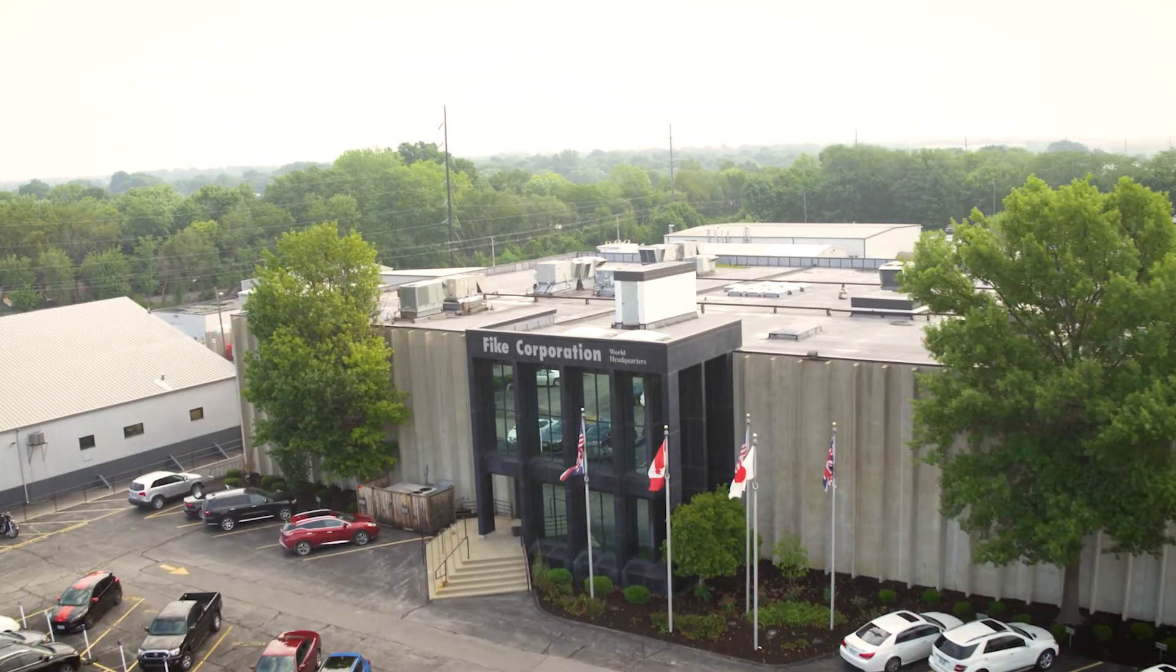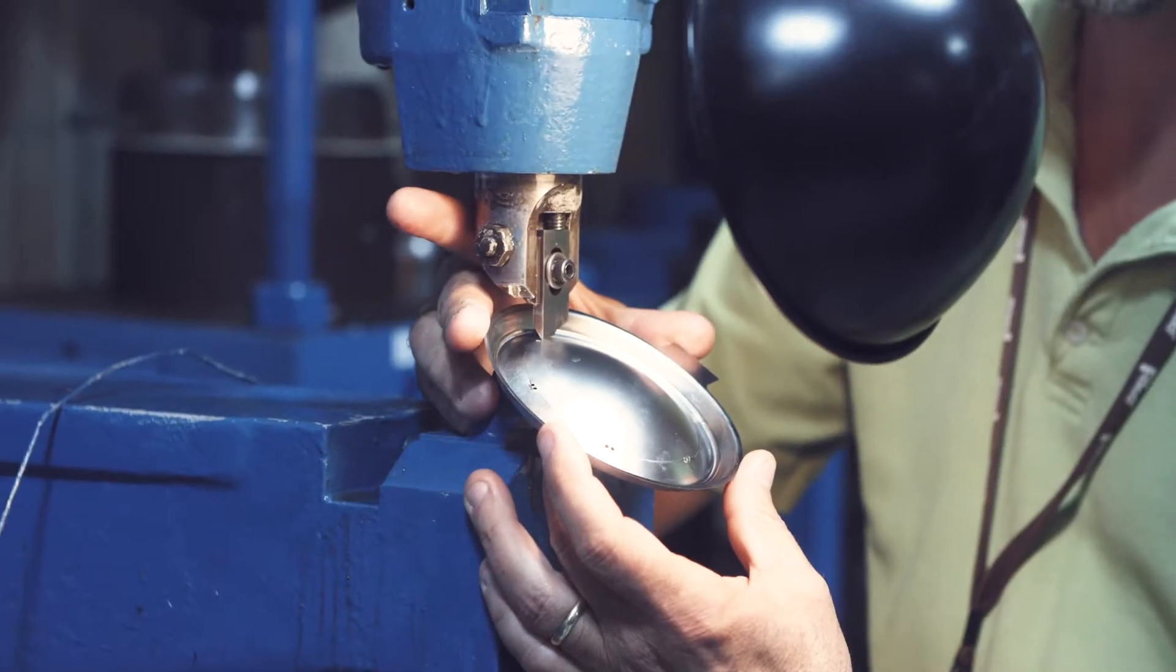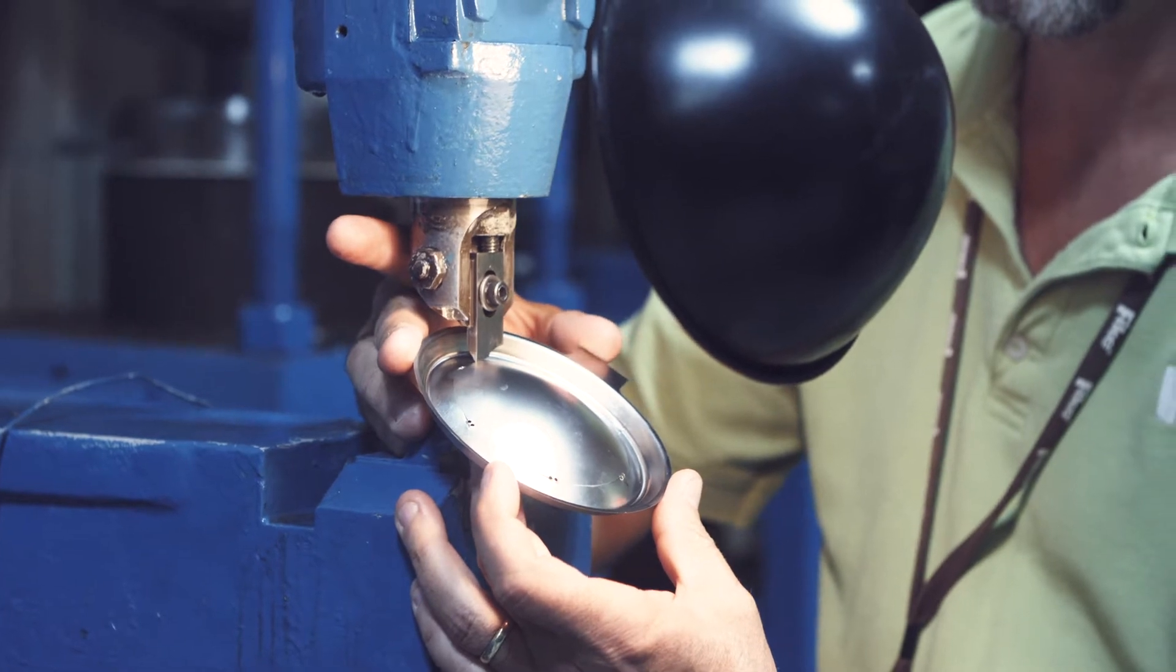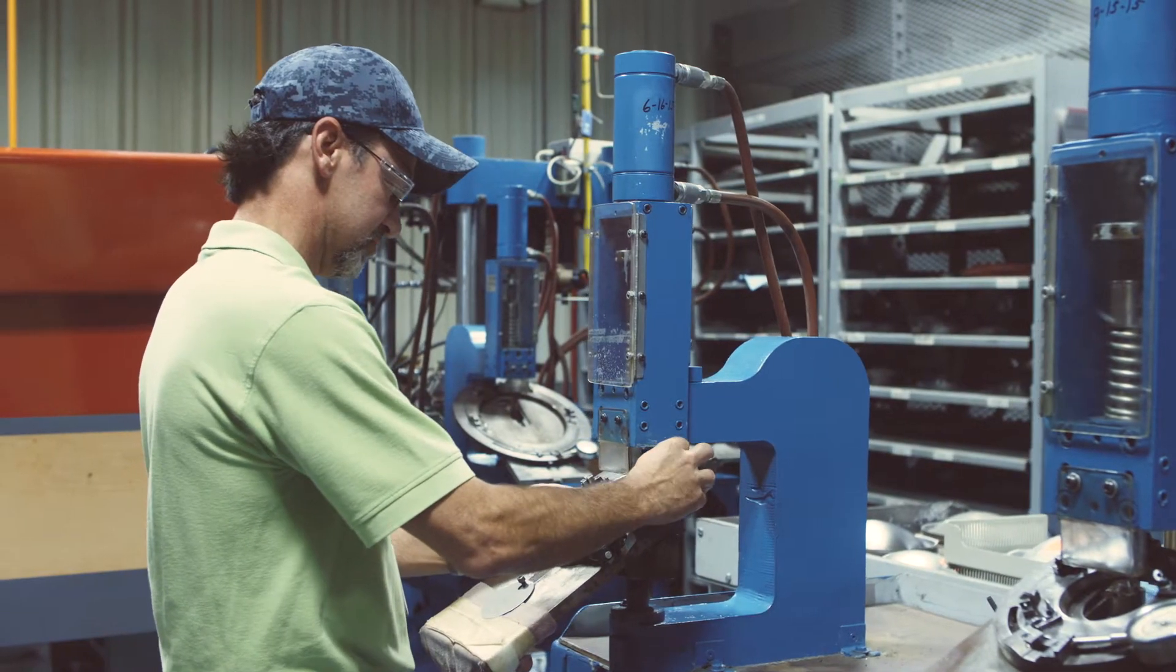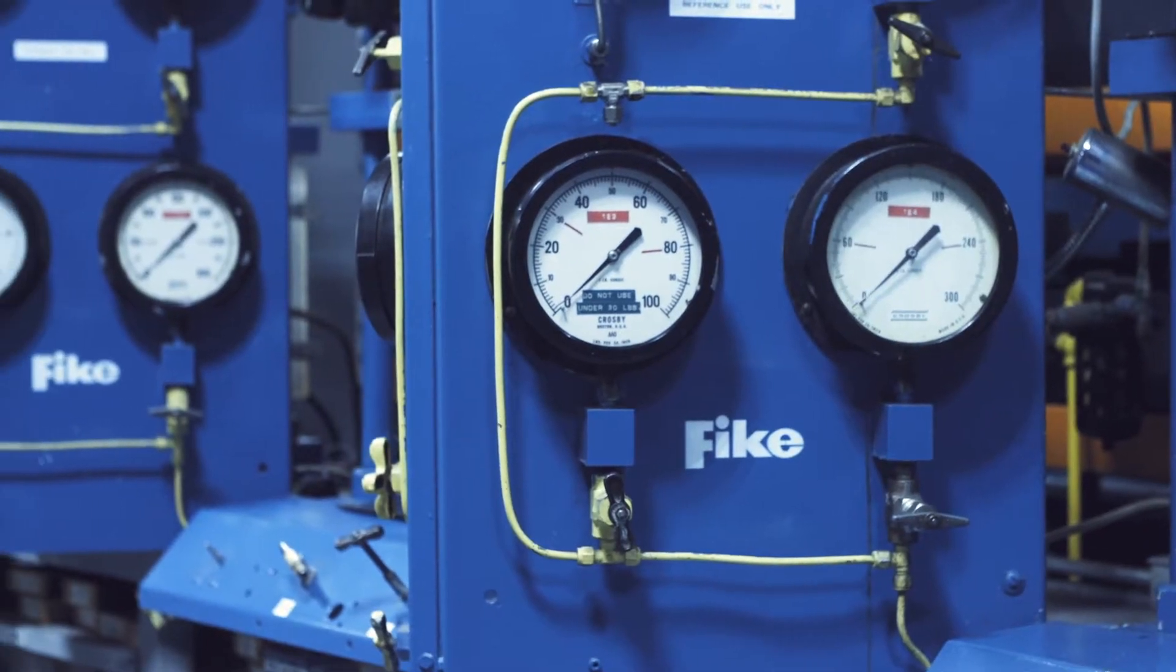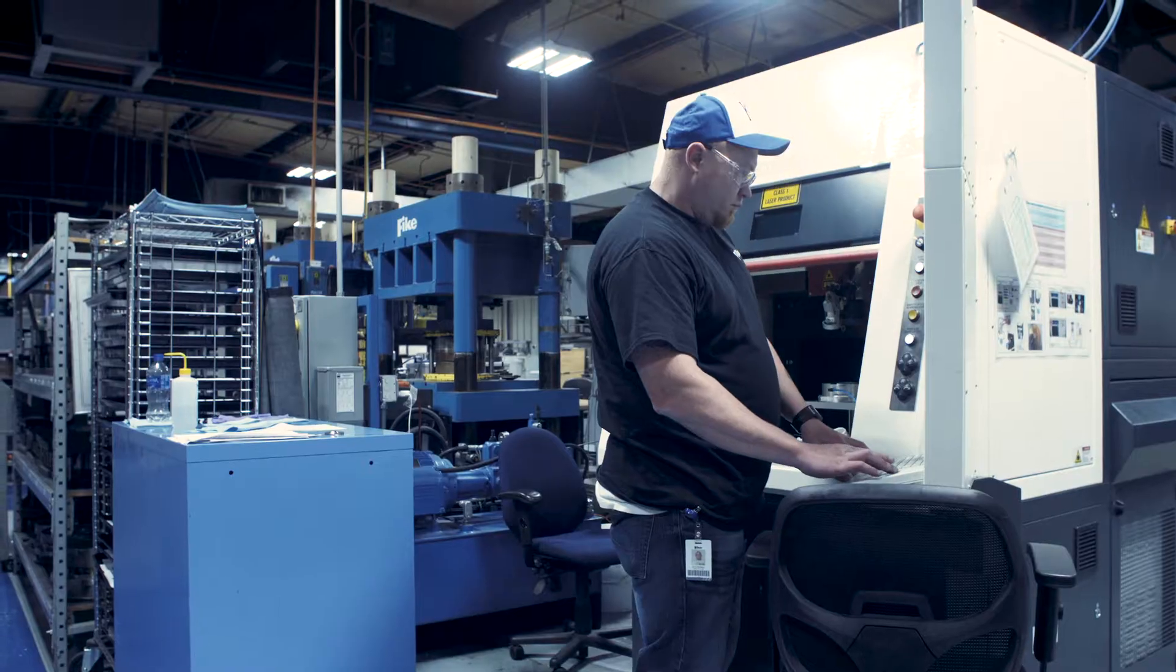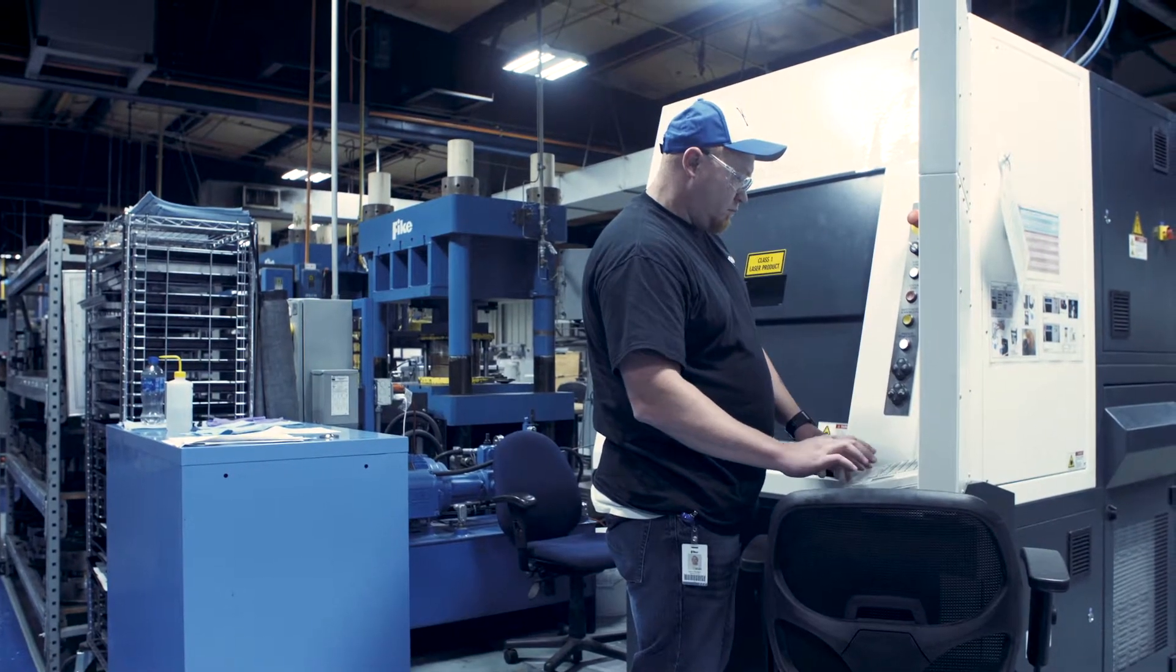FIKE is a safety company. We make safety equipment and everything the METLAB does contributes to the quality and the reliability of the products we make.